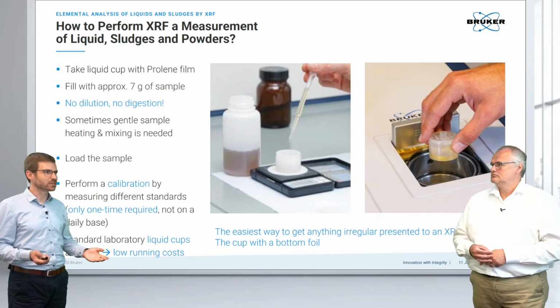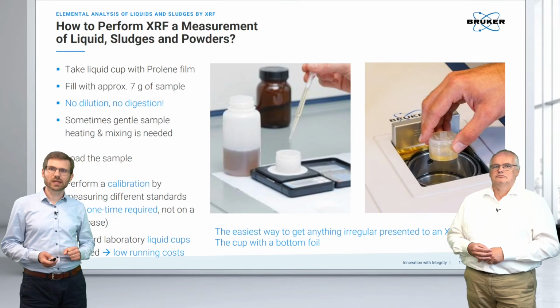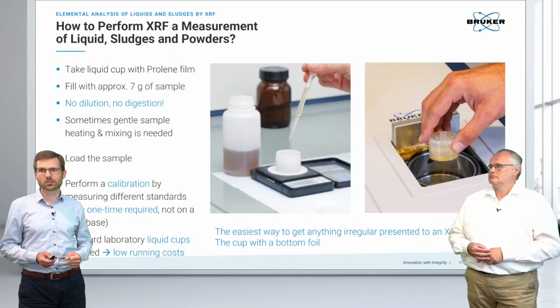There are different classes of devices, like this one, a very small benchtop device, where you would load it manually. But then there are also large floor-standing devices with many positions where you can load your sample into an auto changer. That will be shown later by Renata.